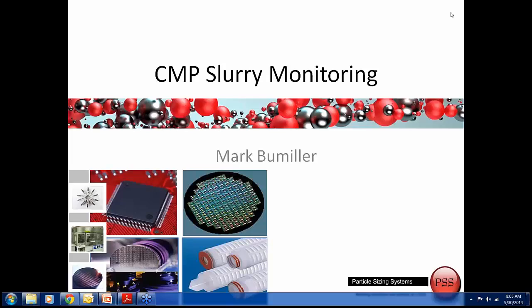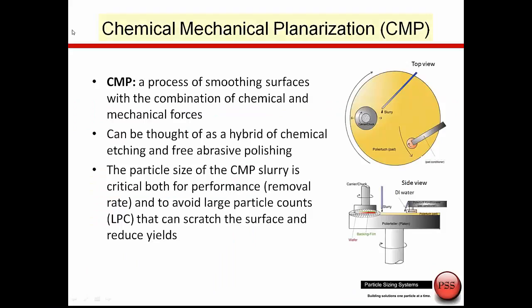What we will be discussing today is CMP slurry monitoring, specifically particle monitoring in CMP slurries. People call it chemical mechanical planarization, or also chemical mechanical polishing. What we're going to do is we have a silicon wafer that we need to flatten, to planarize.